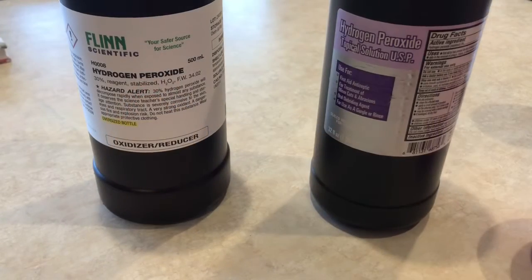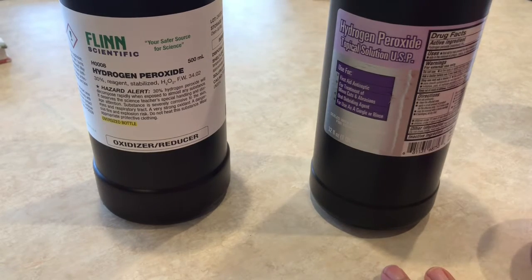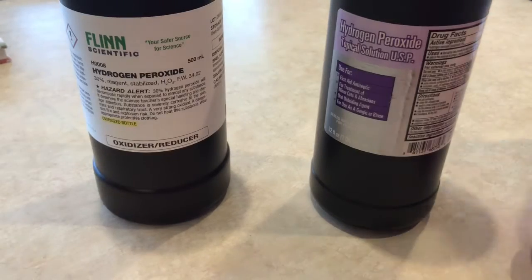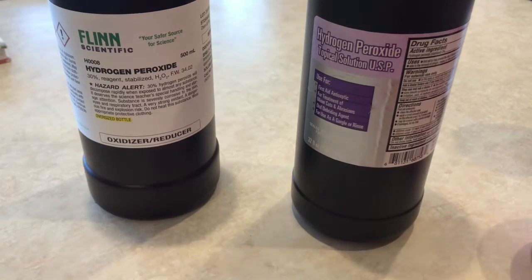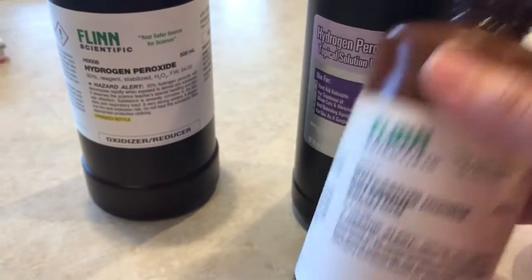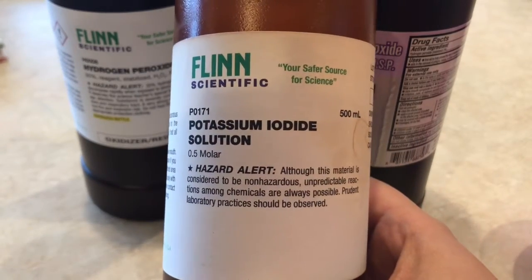For the second demonstration, we're going to look at 2 different factors that affect rate of reaction. One is a catalyst, and the other one is the concentration of a substance. For this one, we are going to be doing the classic elephant toothpaste demonstration, using 2 different kinds of hydrogen peroxide, and our catalyst for this experiment is potassium iodide.